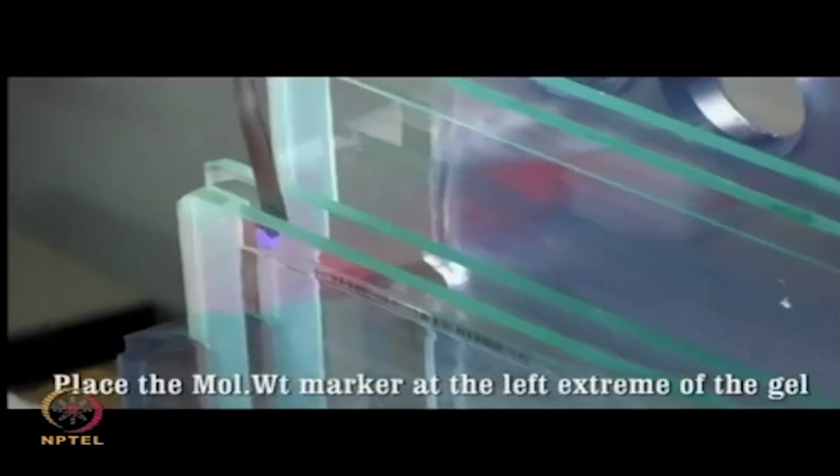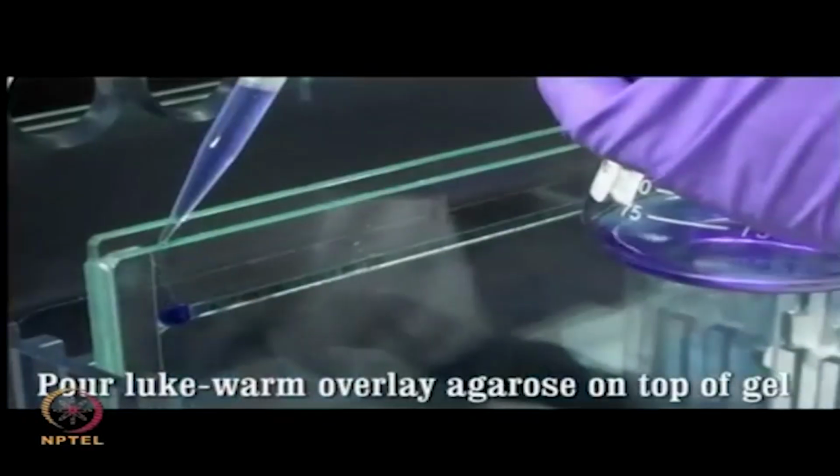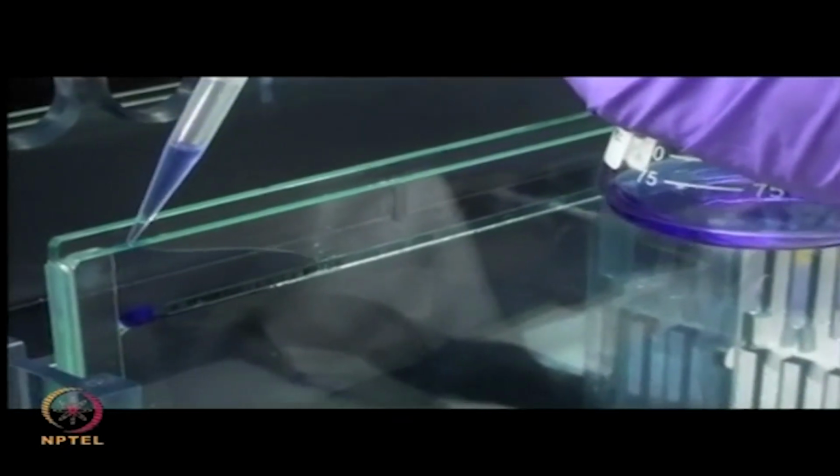Place the filter paper containing the molecular weight marker beyond the positive end of the strip. Then pour the lukewarm agarose overlay solution over the strip to prevent the gel from drying up.